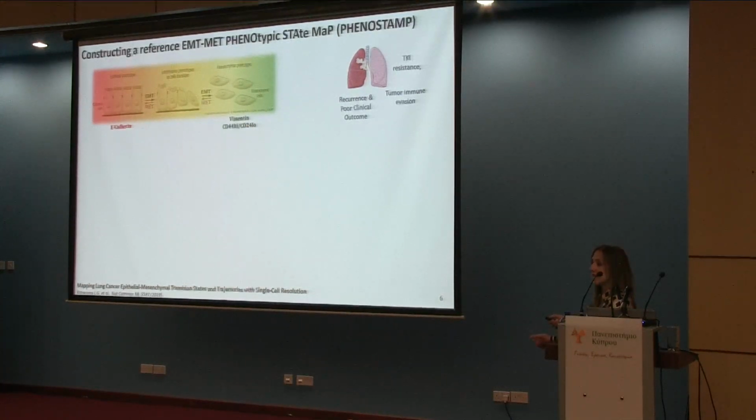You first have to understand it, describe it, and then try to target it. And because it's such a complex and also reversible process at any given time, when I started this research, I wanted to use CyTOF to well-define with proteins that would describe each and every one of these states. And it's important to understand that it's also reversible.